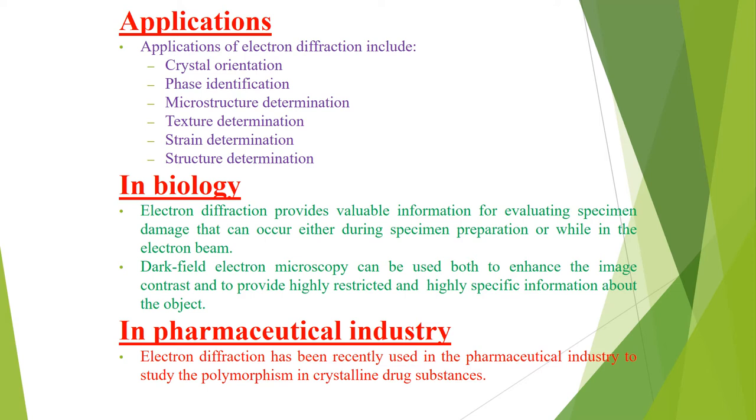And when we discuss its application in the field of biology, electron diffraction provides valuable information for the evaluation of specimen damage that can occur either during specimen preparation or while in the electron beam. Dark field electron microscopy can be used both to enhance the image contrast and also to provide highly restricted and highly specific information about the object.